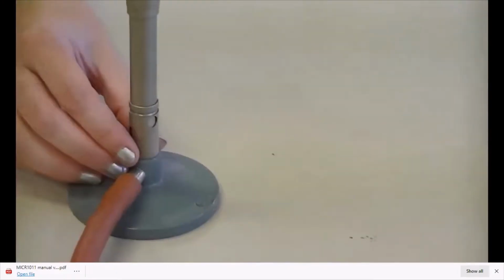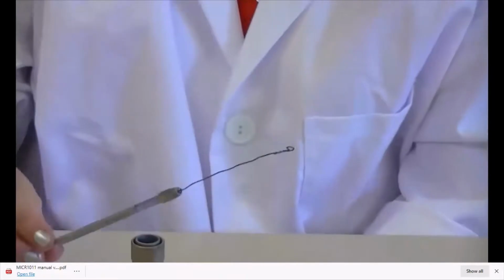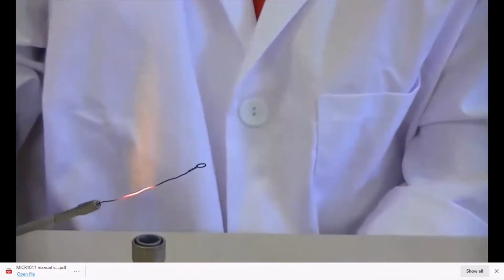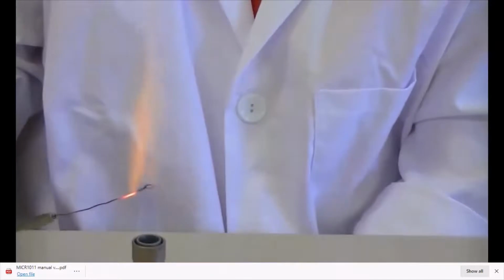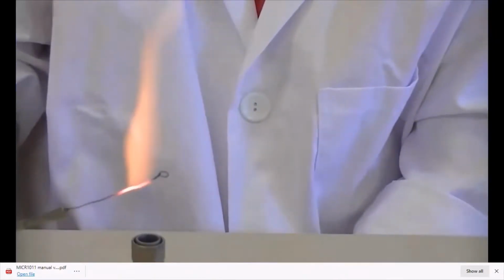To transfer your organism, you want to make sure that your Bunsen flame is turned to the blue flame, so that you can see the apex of the flame. You will need your loop, and you're going to sterilise it in the flame. The loop is a piece of wire with a loop on the end, and you want to make sure that the entire surface of the loop, including the stem, is sterile. You hold it in the blue flame, and you can see it turns orange when it gets hot. You want to make sure the stem and the loop is sterile.